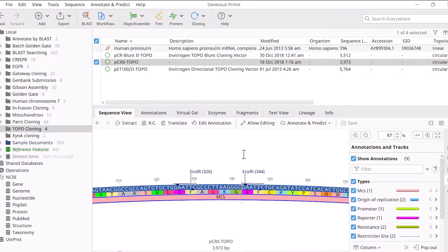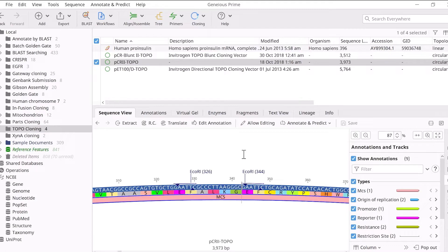Because Topo TA cloning is non-directional, the insert is equally likely to ligate in both directions. Therefore, Genius will only take the current orientations of both insert and vector to perform cloning.